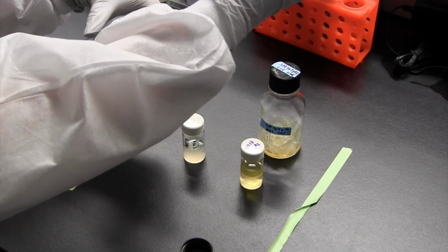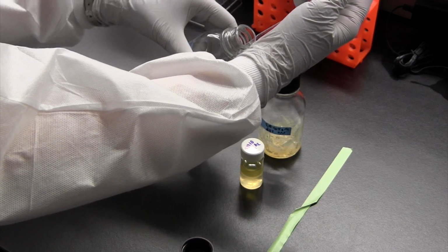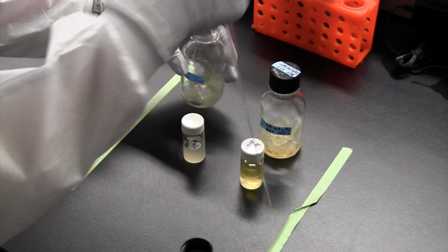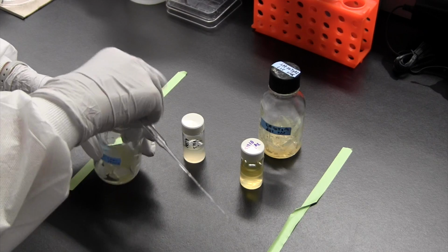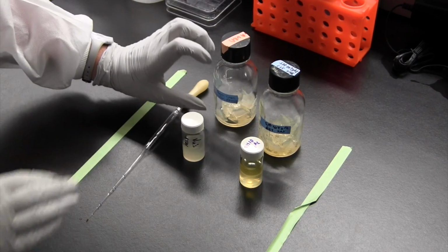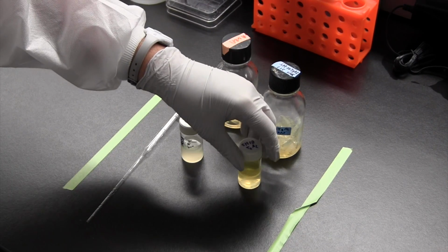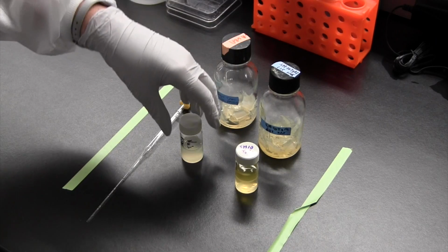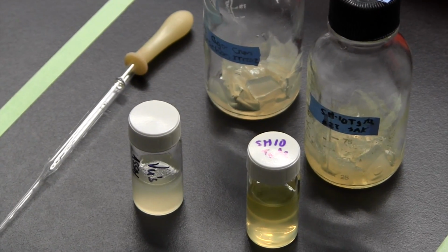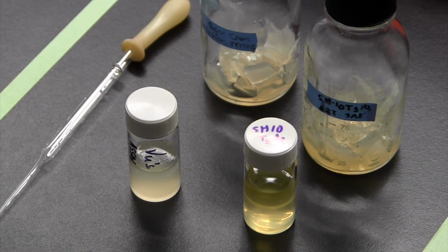They've gone in with their clean pipette and drawn out all of the ethyl acetate layer. So there's nothing left in here because it's all been drawn out and emptied into this scintillation vial. What we wanted to illustrate for you is that once you take the extract off of your agar and empty it into the scintillation vials, your extracts will have really different personalities, okay? And those are going to depend upon both the type of media that the bacteria were grown on, and also what bacteria were present.